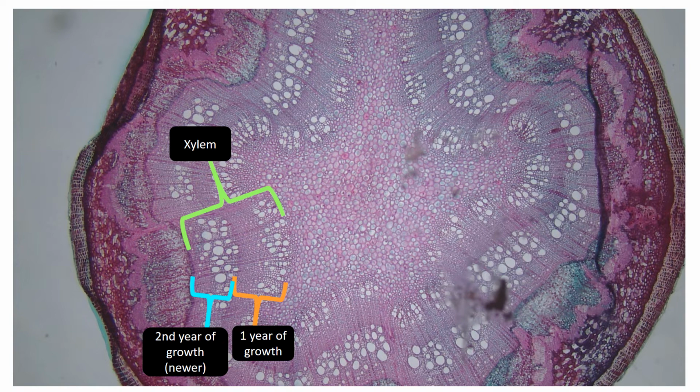And as the plant continues to divide and grow and widen, you'll have more and more of those rows that push themselves out. And it's the outermost layers that will be the most active when it comes to actual water transport. Then we got our phloem up here. Again, tiny little sliver piece. That's the phloem. It's very delicate.